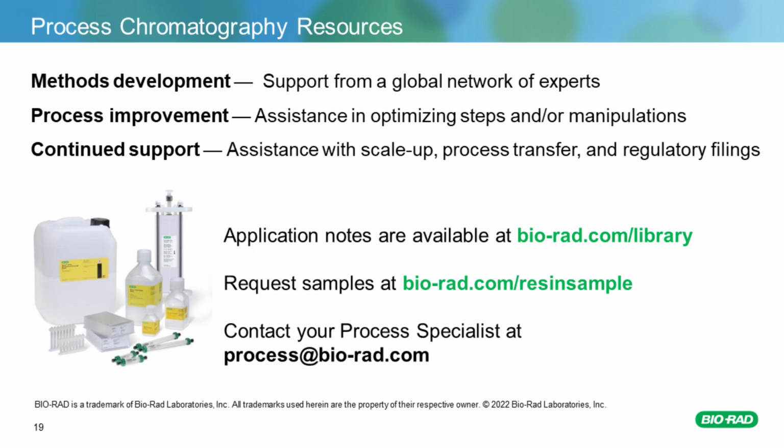Okay, our next question is, can Nuvia HPQ resin be used for the purification of siRNA, miRNA, and aptamers? That's a really good question, Alex. As some people may or may not know, oligonucleotide-based drug platforms comprise many different types of nucleic acids. We discussed antisense oligos here, but siRNA, miRNA, and aptamers also fall under this classification. So I feel pretty comfortable to say that Nuvia HPQ would be able to purify those as well.